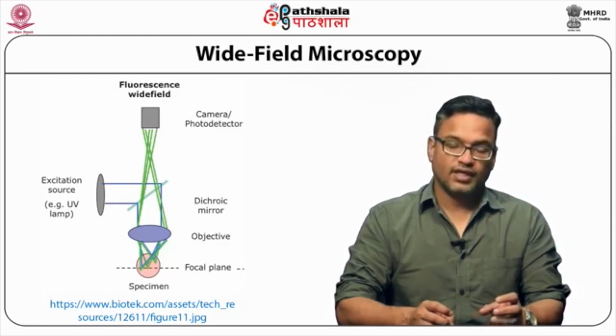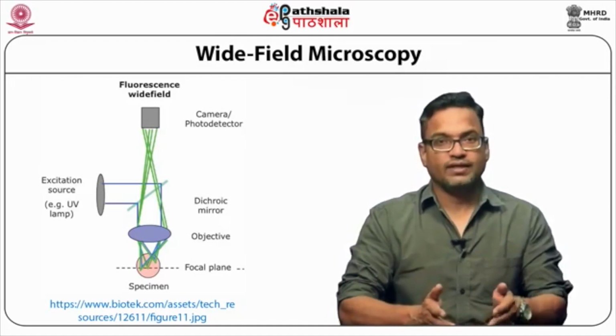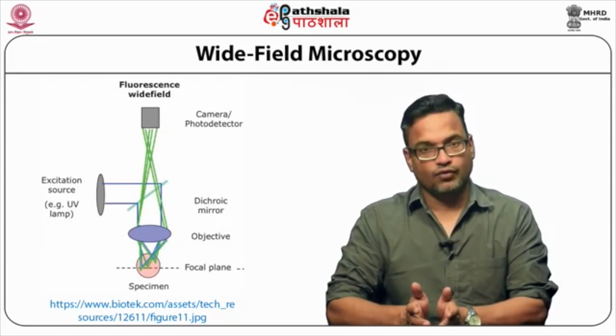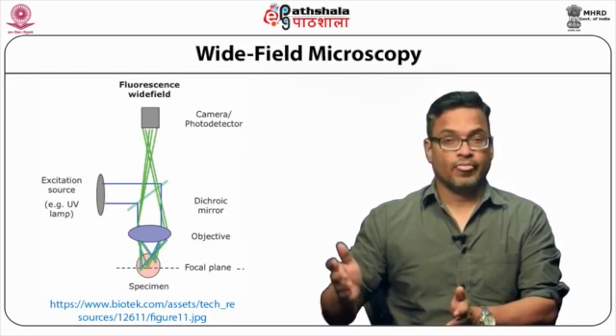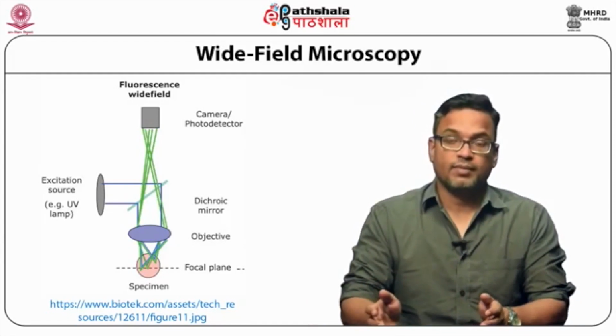So what happens in that case, one fluorophore is excited, and while it is emitting in a longer wavelength, that wavelength can be utilized by the other fluorophore, which can get excited in that long wavelength and also results in a subsequent activation of a fluorophore which can be captured by a microscope.